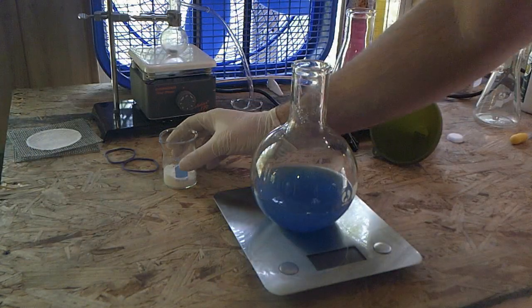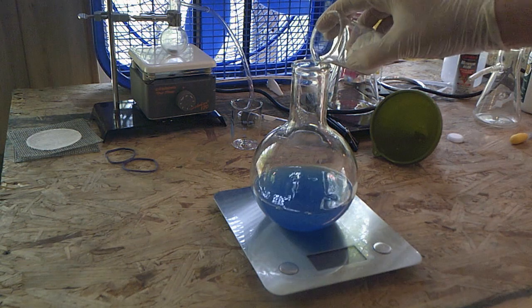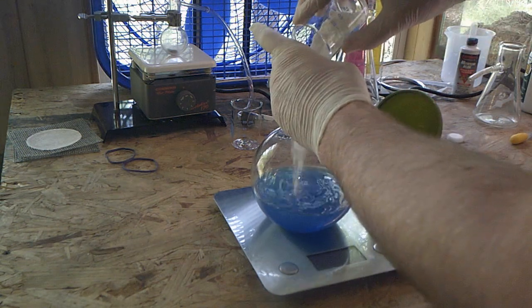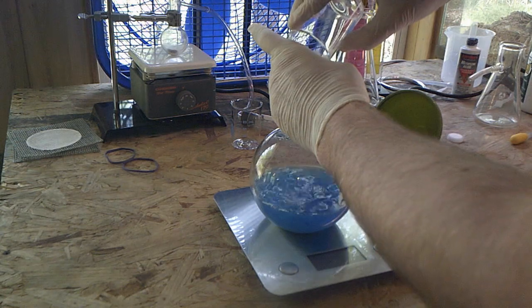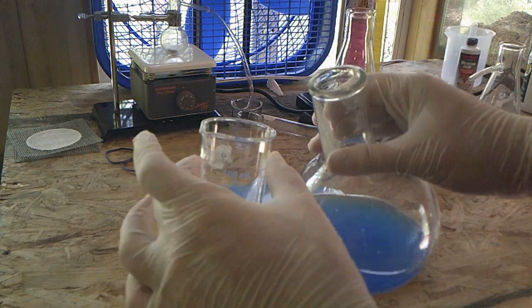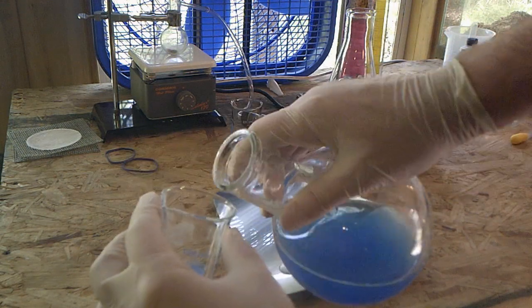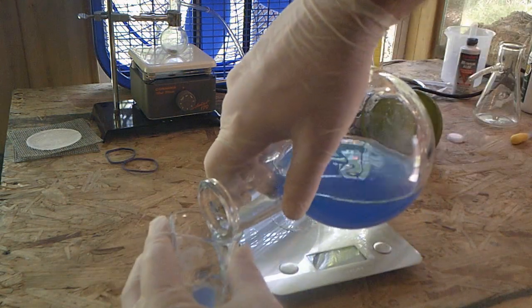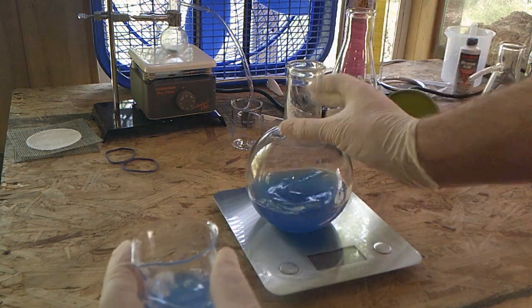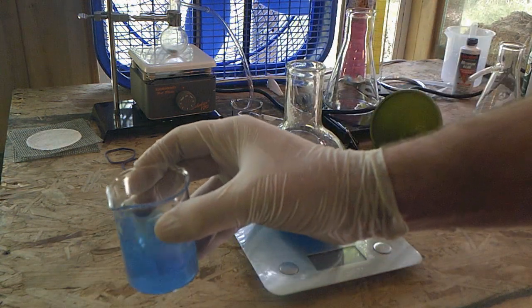All right, let's do the same thing with our dextrose. Not much dextrose left behind, but we'll do the same thing. We'll do another wash just to clean this one out. And this also serves the purpose of helping us mix our solution while we're doing it. Give it a little bit of a swirl.